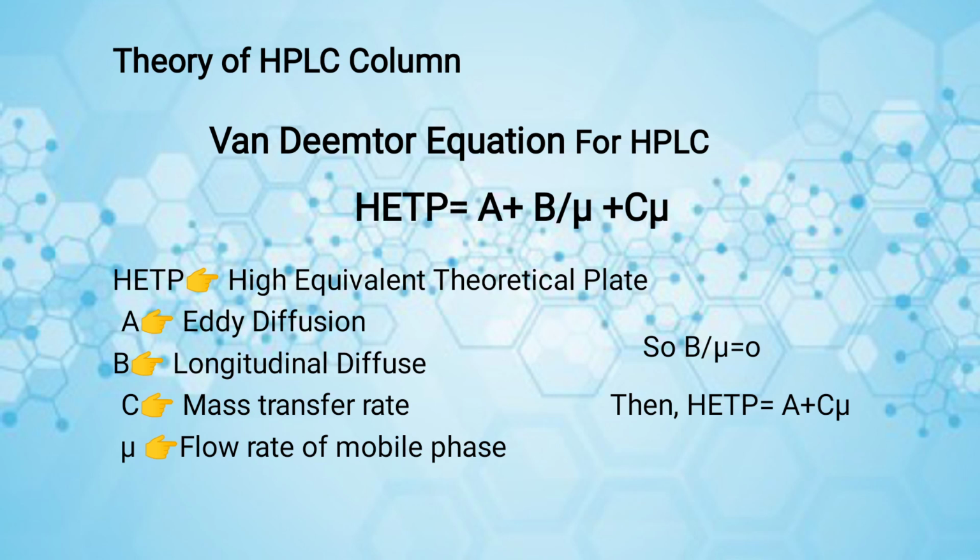So generally we are using methanol, acetonitrile and water as the mobile phase, because generally we are using reverse phase column chromatography. So the commonly used solvents are acetonitrile, water and methanol, and in these solvents we add acidifier, basifier or buffer solution for better separation, because this acidifier, basifier and buffer solution will neutralize the ionized analyte compounds present in our column, so separation will be better.